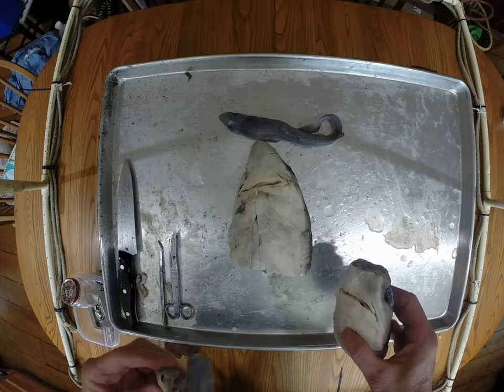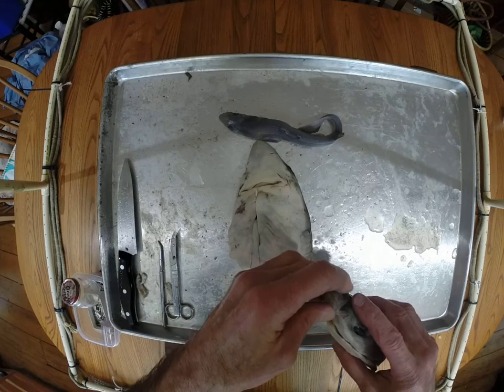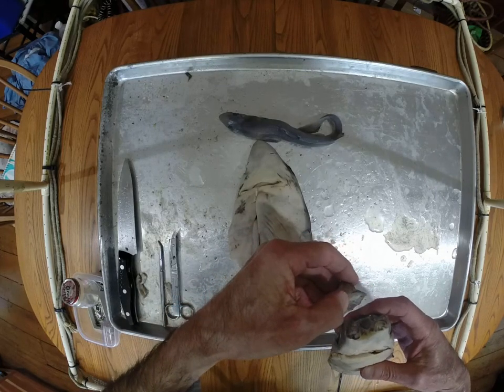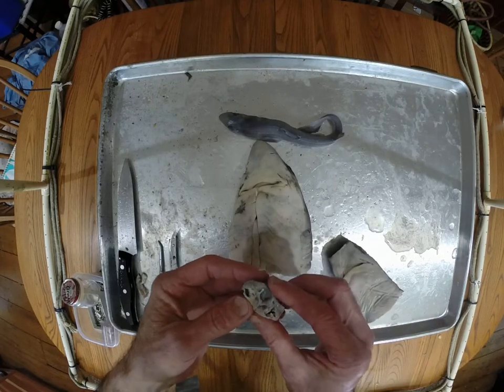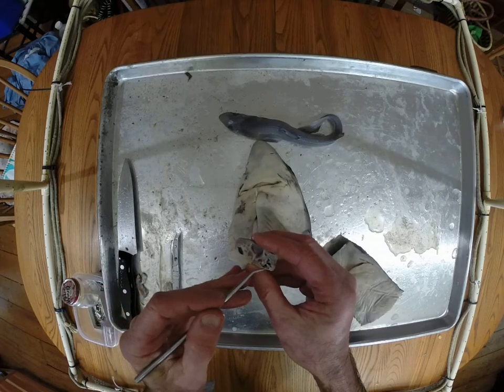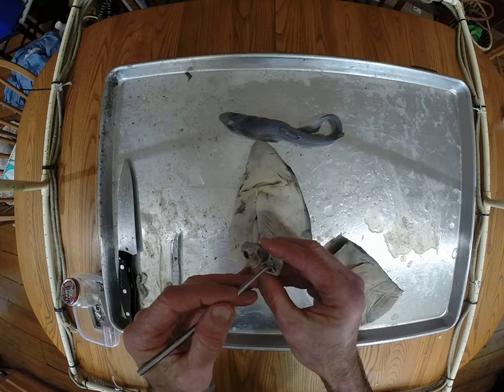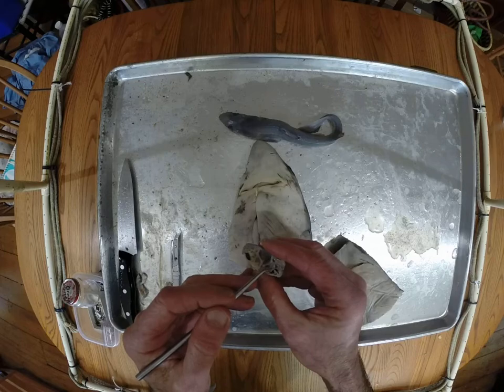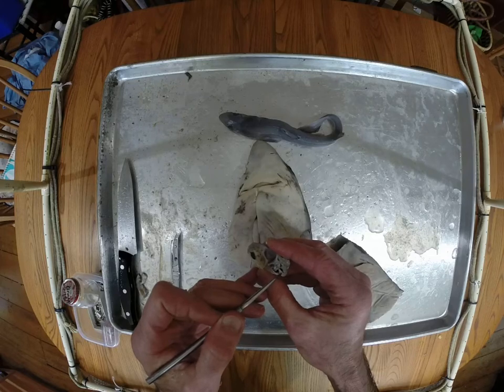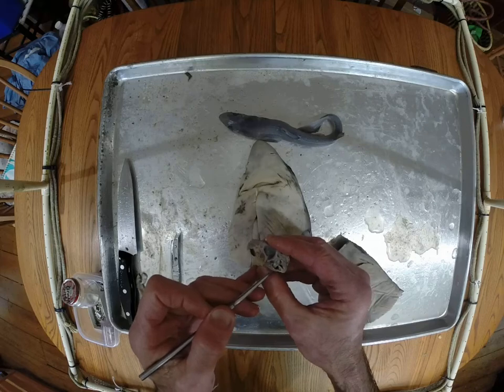Okay, I wanted to first go back to the rostrum. So here on this male, I've made a section through the nares so that we could look at the olfactory bulbs. And if you look in the bulb itself, you can see a bunch of lamellae here that I'm pointing to with the probe. That's where the olfactory receptors are. So as the shark swims through the water, water comes in through the incurrent nares, flows around, through, I should say, through all these lamellae and then out the excurrent.